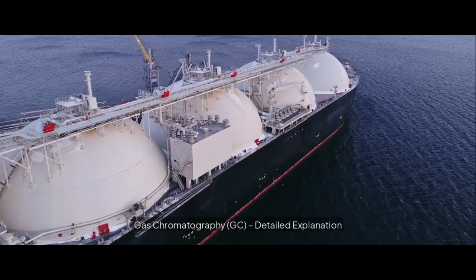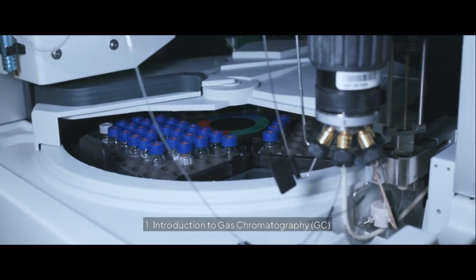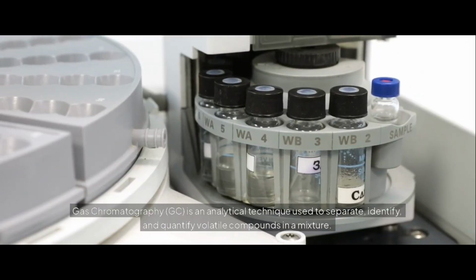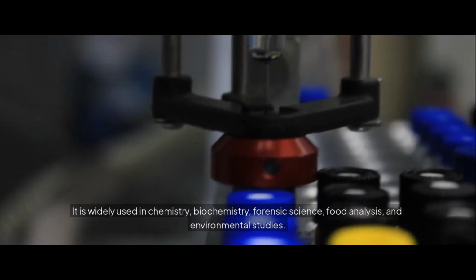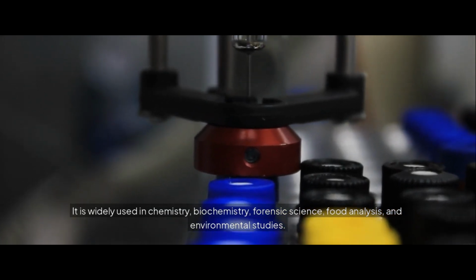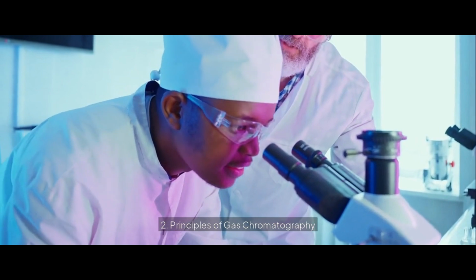Gas chromatography, GC, detailed explanation. 1. Introduction to gas chromatography, GC. Gas chromatography, GC, is an analytical technique used to separate, identify, and quantify volatile compounds in a mixture. It is widely used in chemistry, biochemistry, forensic science, food analysis, and environmental studies. 2. Principles of gas chromatography.